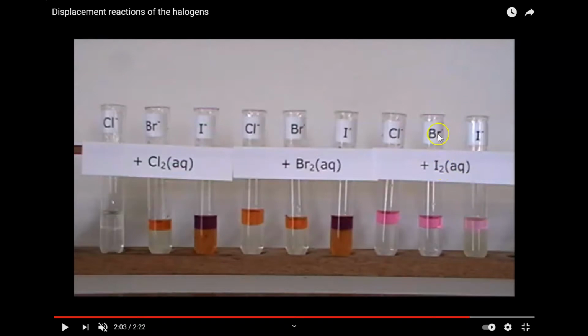So when I combine I2 and Br minus, I see pink in the top layer. It tells me that I2 is less reactive than Br. All right? Okay, when I combine I2 with Cl minus, I get pink in the top layer. It tells me that I2 is less reactive than Cl minus. So it looks like I2 is my least reactive.